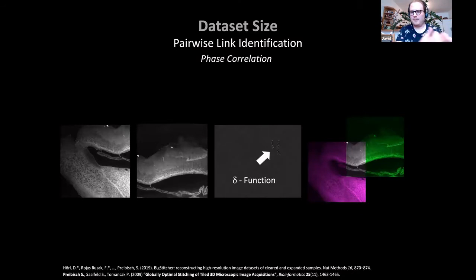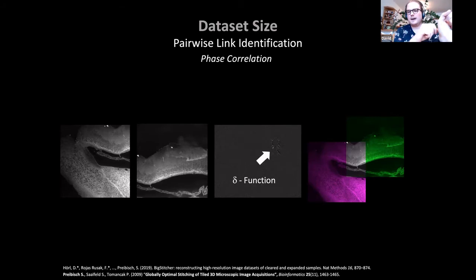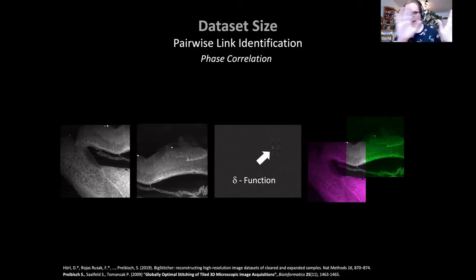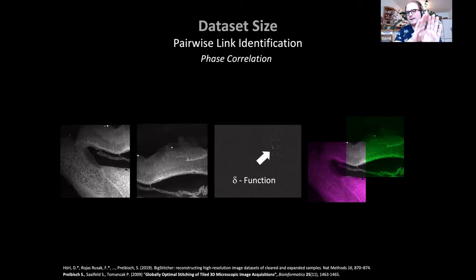Many of the subsequent steps can be done on downsampled versions of the images. We offer the possibility to re-save data in a multi-resolution pyramid format where you save not just the full-resolution image but also downsampled versions in formats like HDF5 or N5. That way you can do lots of the work later on a smaller version, which reduces compute time significantly. Once we are able to load the image data, the first task is to find out how pairs of images are transformed relative to each other.